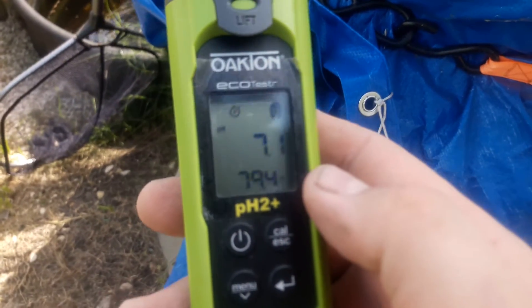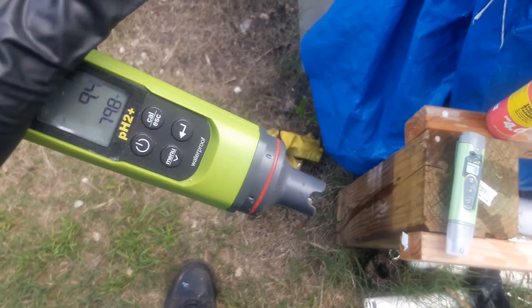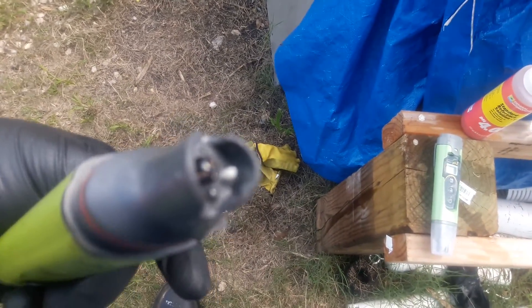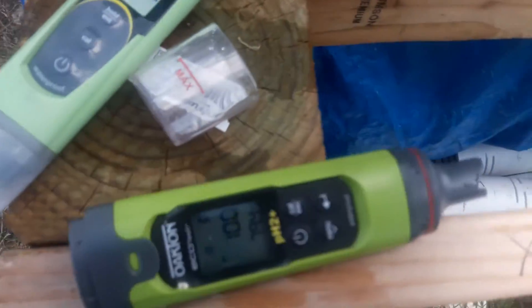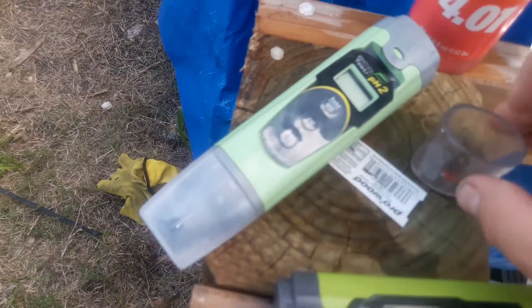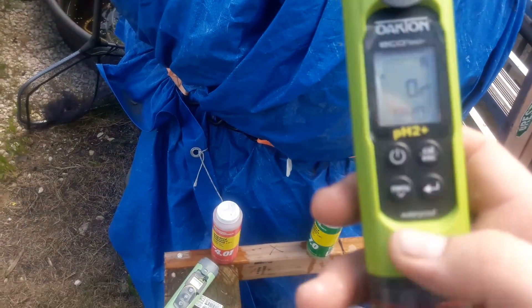Quick and easy — just hit the calibrate button and it's done. When you're putting the tester away for storage, always clean off the sensor and rinse it with distilled water. First rinse off the probe itself, then rinse out the cup, and make sure it's nice and clean for the next use.